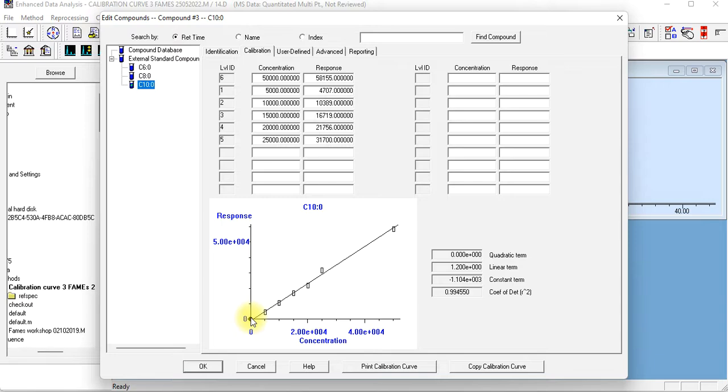So if you are advising students in the lab, in your master's or PhD students, that is the recommendation. Most people only use 5 calibration points, which is inaccurate. Usually in my Department of Chemistry Malaysia, in my tenureship, the way that we evaluate the expertise of any chemist, those who can get R square nearer to 1 will be applauded.